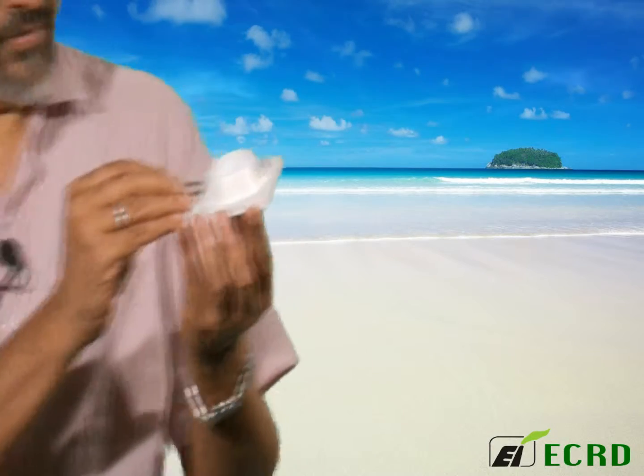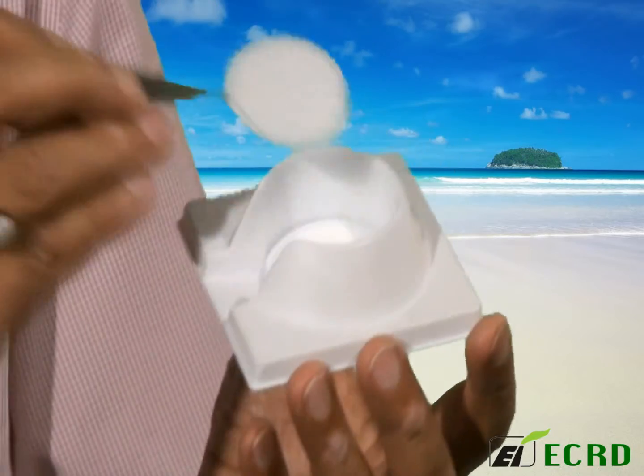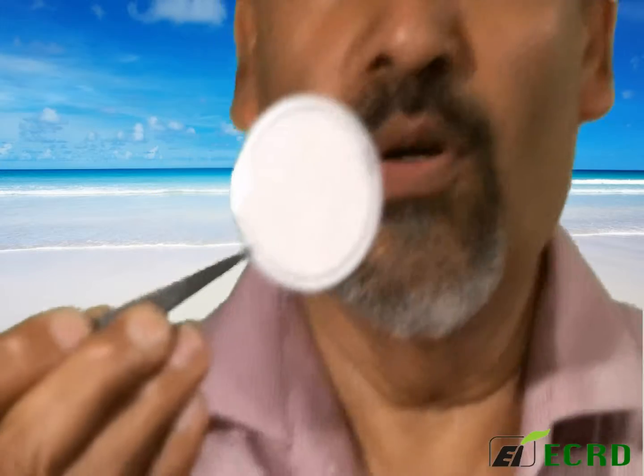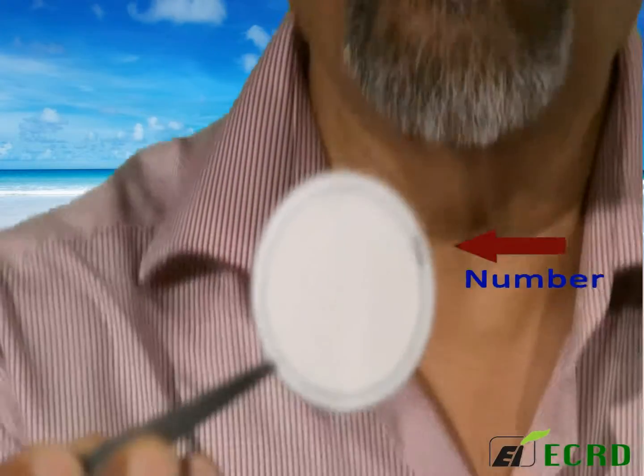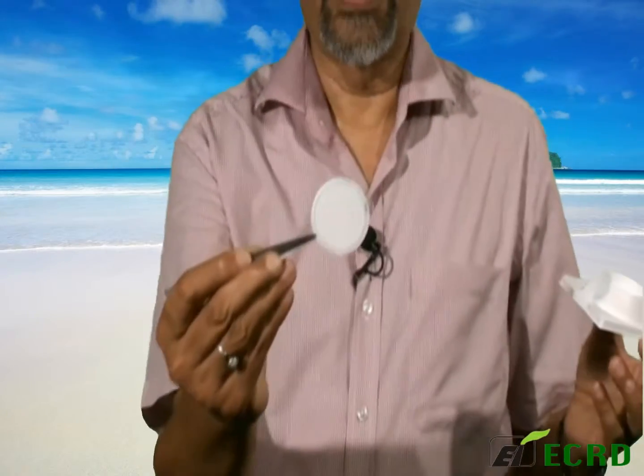Also handle the filter very carefully from only the edges. You will see that it has a special support ring all around with a number. That number must be recorded for all your measurements to be traceable to a specific filter.